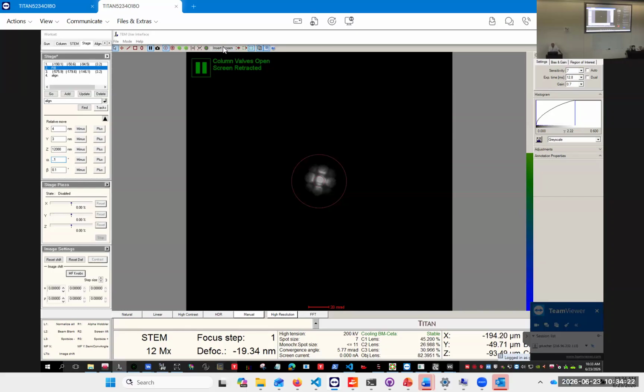Yeah, I wanted not to do the camera length right now, so we'll handle that in a second. Yeah, so that is the other thing. We can move the aperture. Okay. Okay, here's inserting. Okay, so finally, we first want to try to use the aperture, so we want to go a little bit more negative.